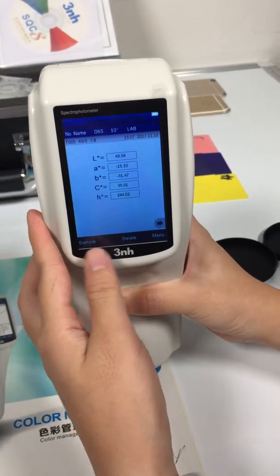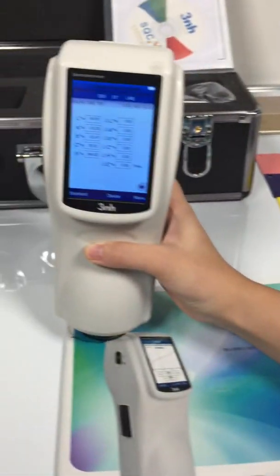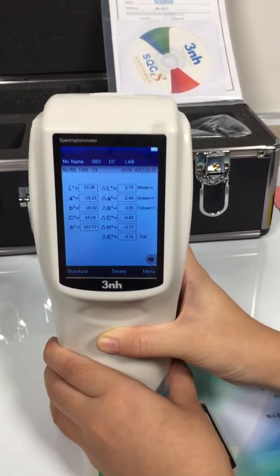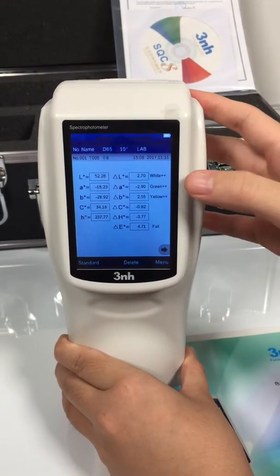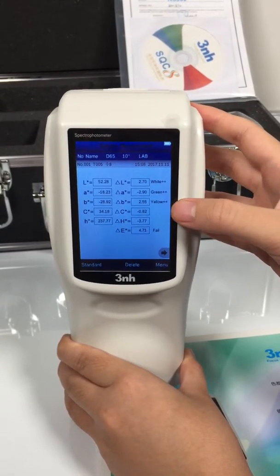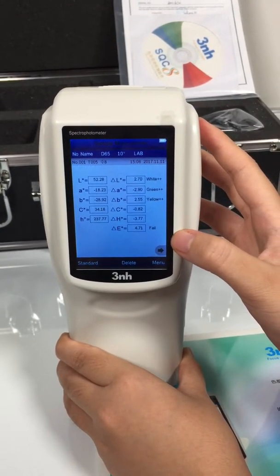Then we switch to the sample testing. Okay, we can see the results. The results mean that comparing with the standard sample, it is more white, more green, and more yellow. And delta E means the color difference between the standard sample.